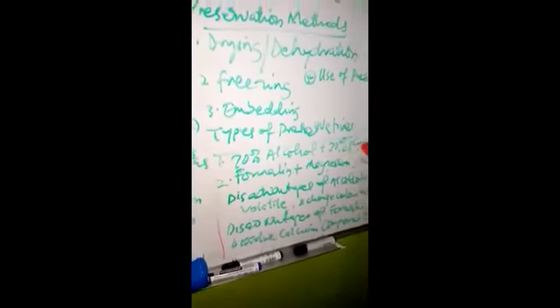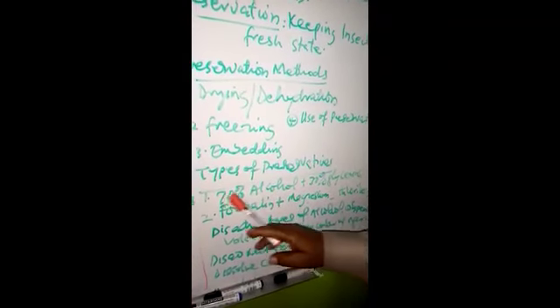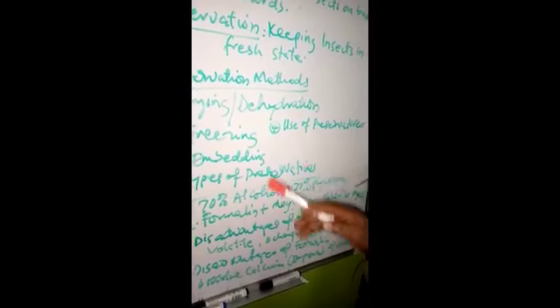Any insect you preserve can stay for 50 to 100 years in the same condition. What you only do is that every 2 weeks or every 2 months, you change the liquid. Insects that were preserved since 1960 are still there in the museum. What you only need is to be changing the preservative at intervals.